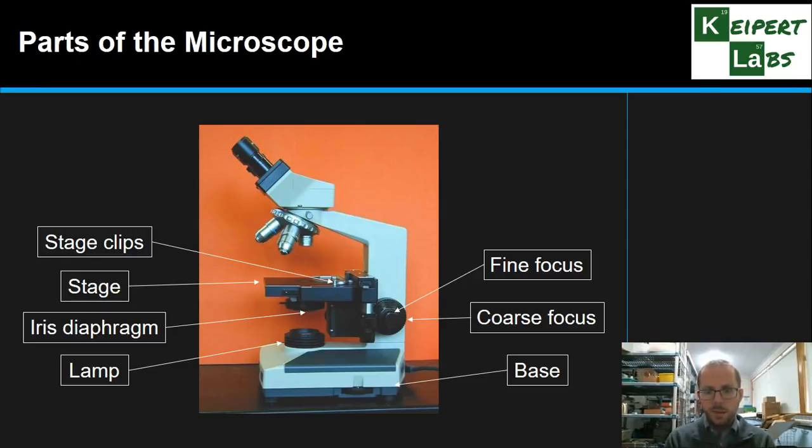So as we're really close to being in focus, but we need to just make tiny adjustments, we use the fine focus and it tweaks it just a little bit. Especially if we are looking at things under high magnification, we only ever want to change it a tiny bit, because otherwise we're just going to go from one blurry image to another blurry image, and we're never going to see anything clearly. So coarse and fine focus. You can see on this microscope, in a similar way to many of the ones we would use in the lab, that they're both connected to the same dial. The fine focus is the inner bit, and the coarse focus is the outer larger bit. That may be different depending on the microscope.